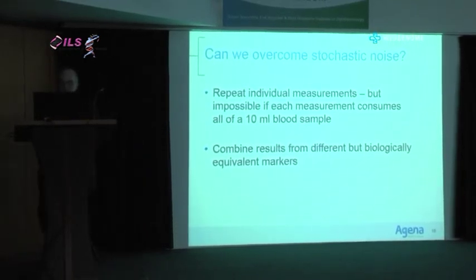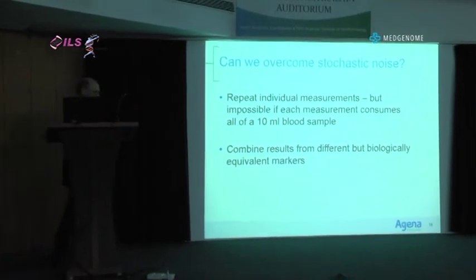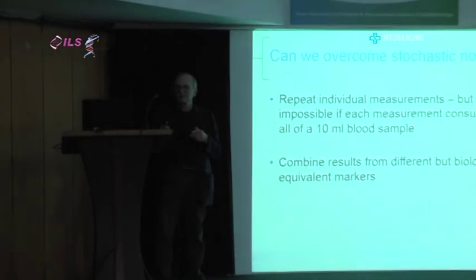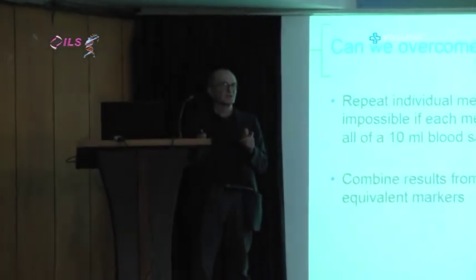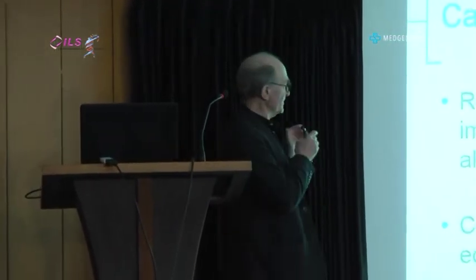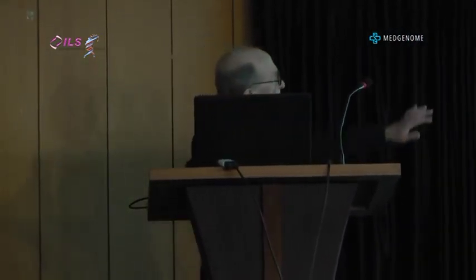So that's the notion. And I want to show you in the last few minutes two very recent approaches that we're taking to try to improve the situation. It's a fundamental problem, but there are some ways to think about it intelligently and try to up the sensitivity, which will help then for those patients who adventitiously have very small numbers of molecules. The first of these is a trick which we call sensitivity enhancement by fragmentation.